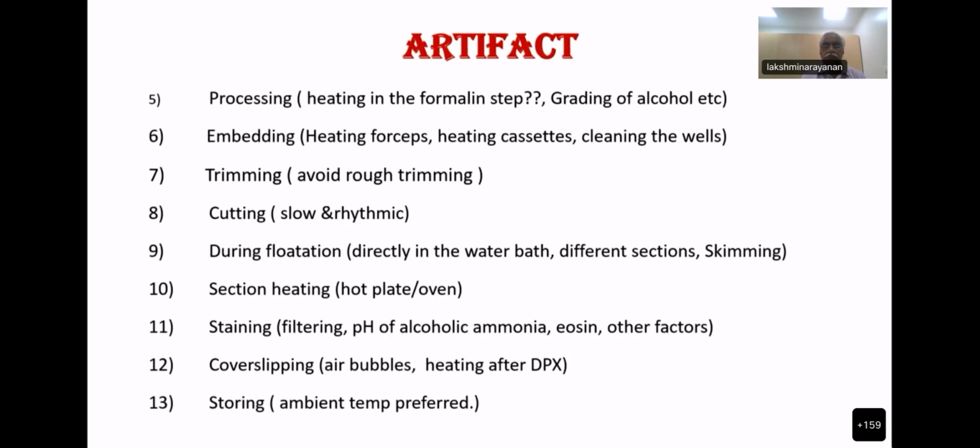Then coming to the embedding heating forceps, which Dr. Mahajan has already mentioned, the forceps is heated, that should not be heated more than 65. So the control will not be there. If people are having the embedding machine, then that can be controlled. If it is not there, then heating or charring artifact will be seen.